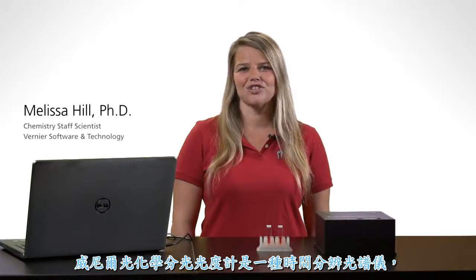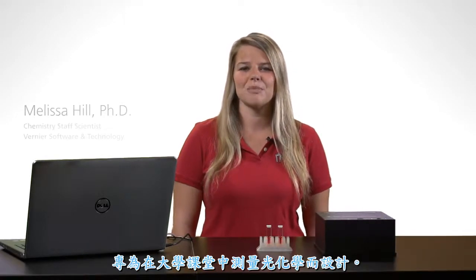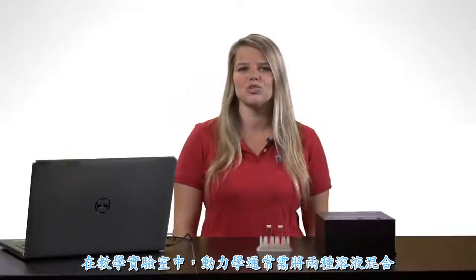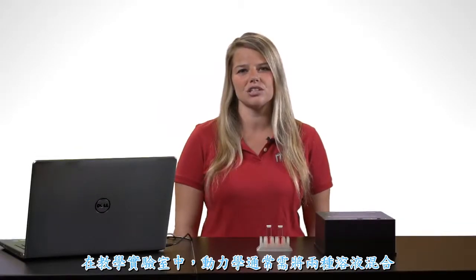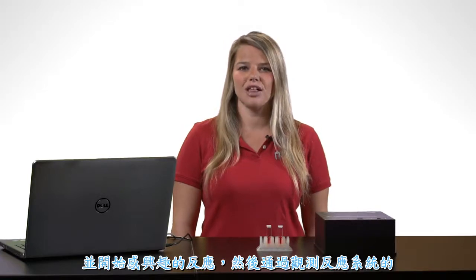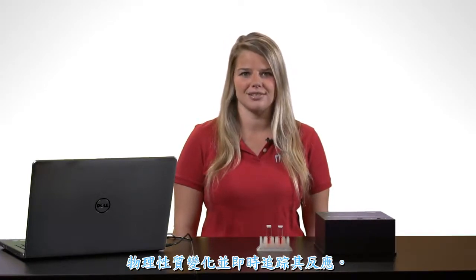The Vernier flash photolysis spectrometer is a time-resolved spectrometer designed for measuring photochemistry in the college classroom. In the teaching laboratory, kinetic studies usually involve mixing two solutions, which starts the reaction of interest. The reaction is then followed in time by monitoring the change in a physical property of the reaction system.